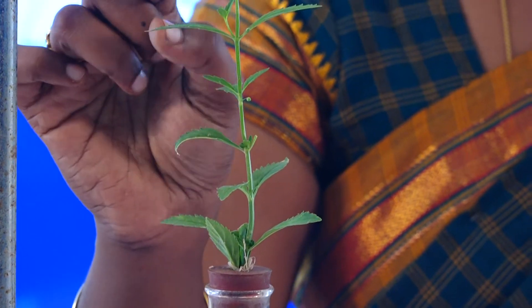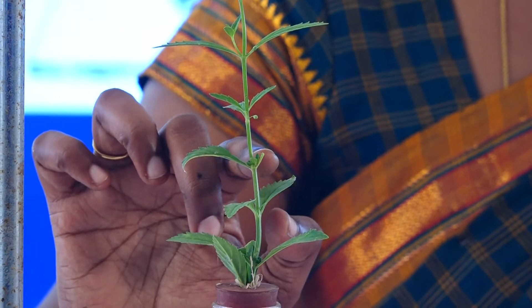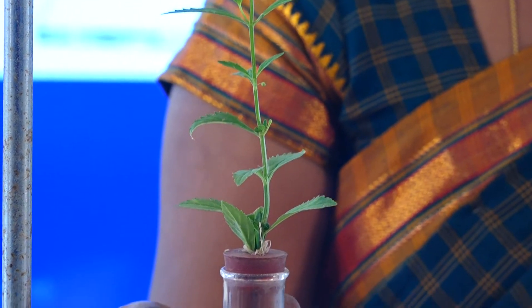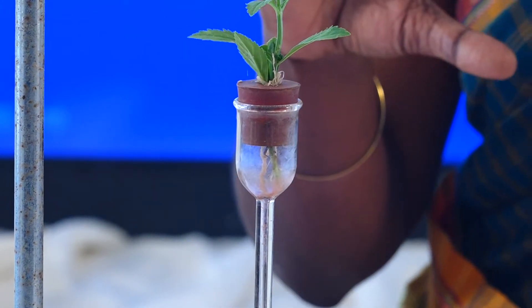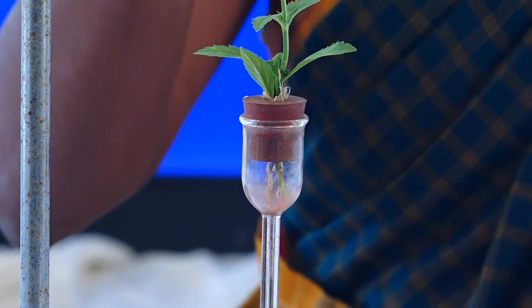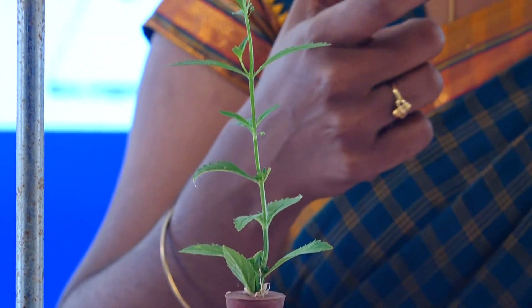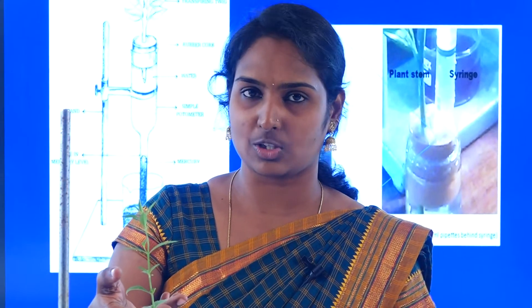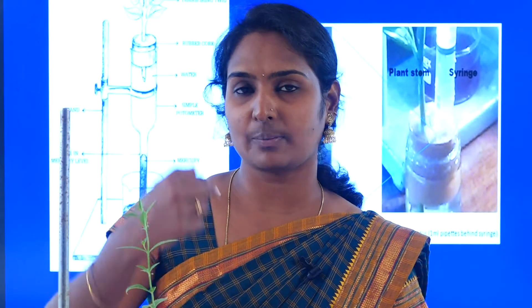Once there is a loss of water in the leaf, automatically the water has to come from the lower part of the plant through the xylem, and from the root hairs. This is similar to taking a juice bottle and inserting a straw — if you suck at the mouth end, automatically the juice rises up in the straw. The same technique is applied for transpiration pull.